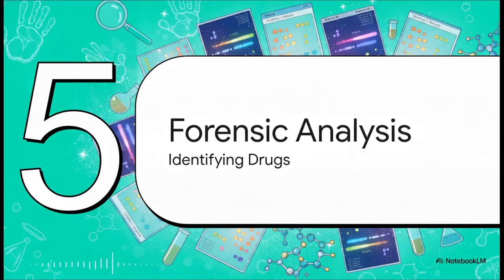Let's apply this in Section 5, Forensic Drug Analysis. So, different drugs require entirely unique chemical systems to coax them apart. What we're looking at here is TLC System 1, which is specifically calibrated for identifying LSD. Forensic analysts use a highly specific mobile phase for this, exactly 1 part chloroform to 1 part acetone.